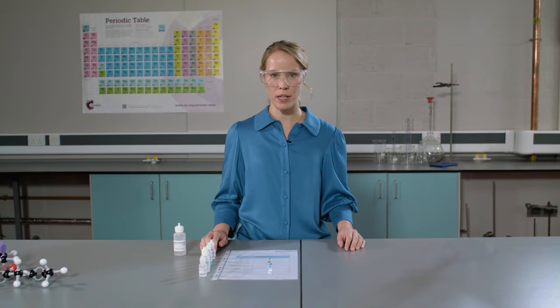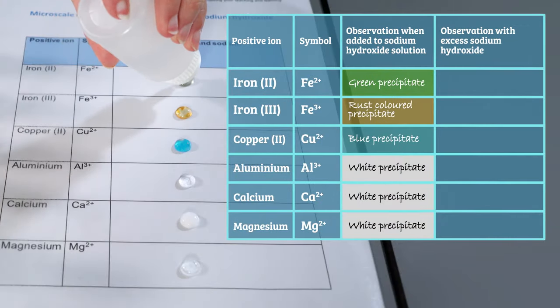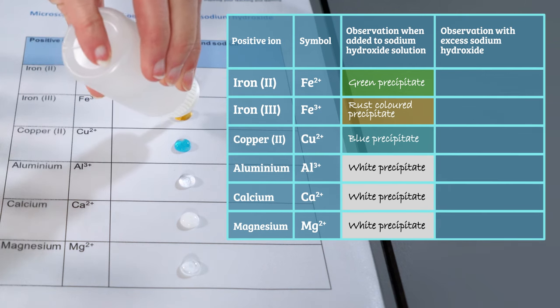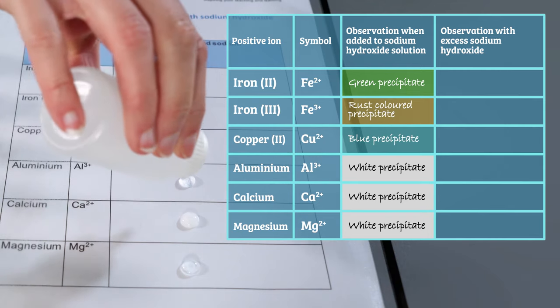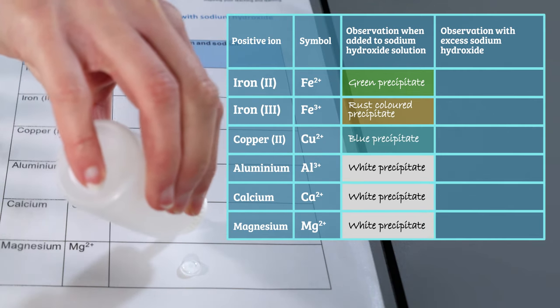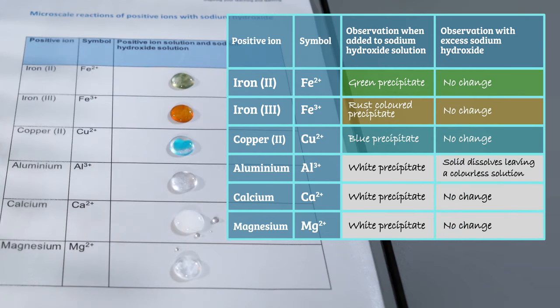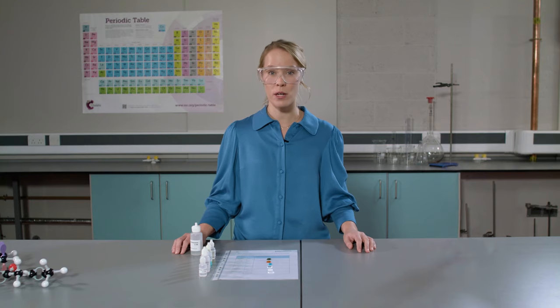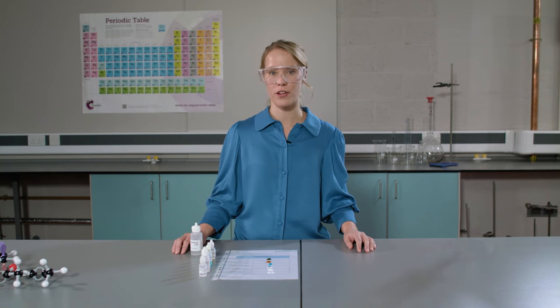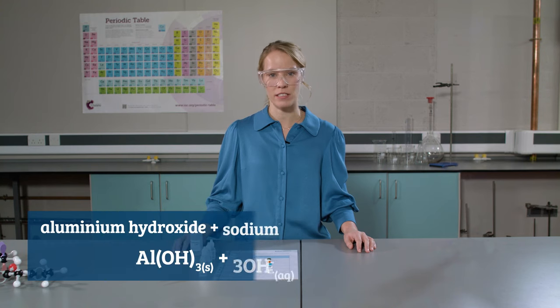An advantage of this microscale experiment is that it provides another way to capture the results before I move on. It is easy to knock the paper, so I would suggest you take a photo on your phone and draw up the results table from the photo. Next I'm going to add excess sodium hydroxide to all of the solutions and observe carefully what happens. When excess sodium hydroxide is added to a sample of aluminium hydroxide, it dissolves to give a sample of sodium aluminate. This provides us with a positive test for aluminium. You may want to take another photo of your results here, but really you just need to remember that this is the positive test for aluminium.